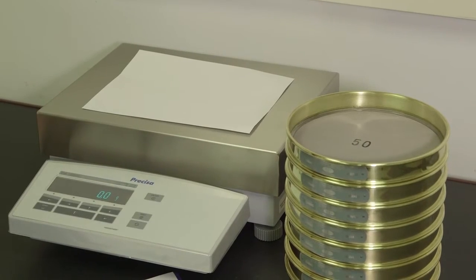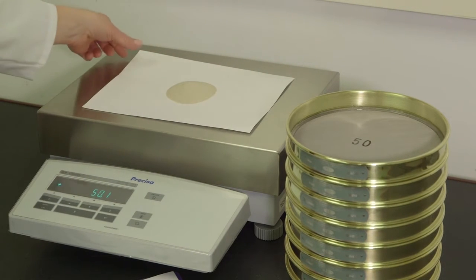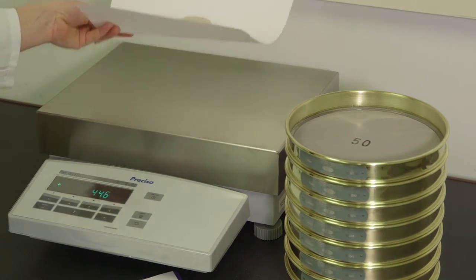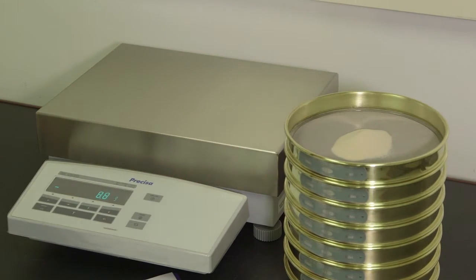The sample size will largely depend upon the weight or density of the material sifted. Refer to Chapter 6 of Test Sieving Principles and Procedures for tips on determining optimum sample size and test time.